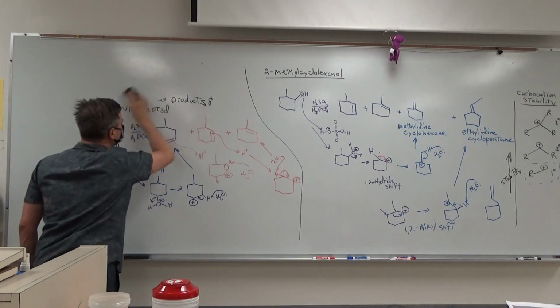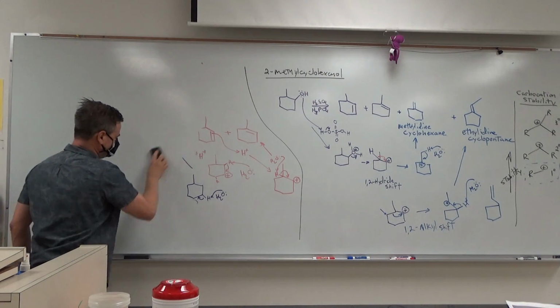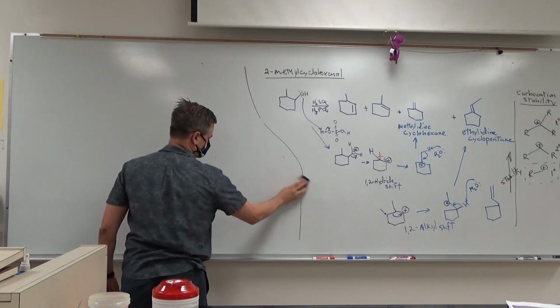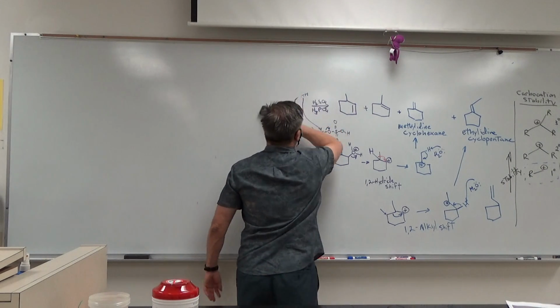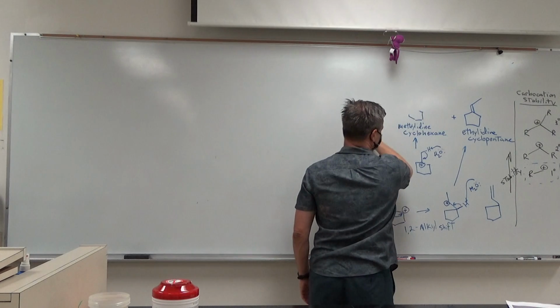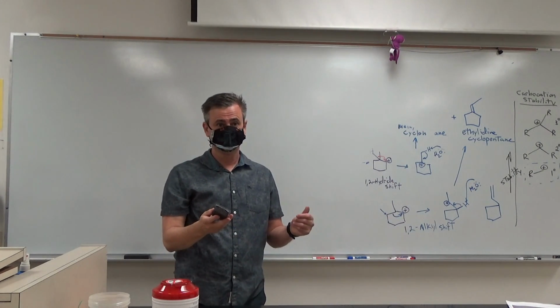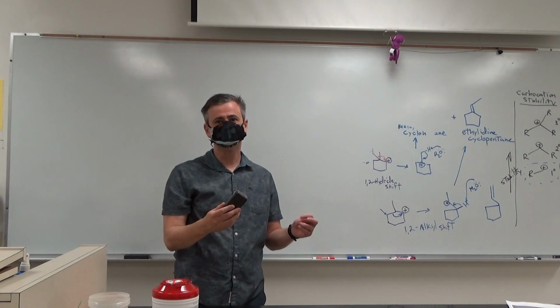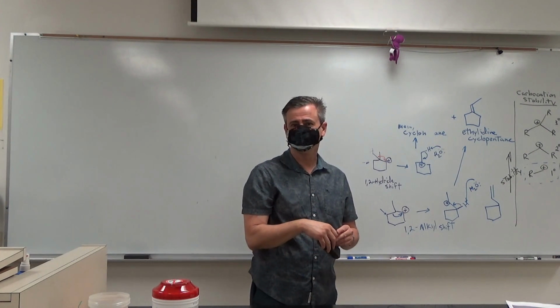All right, I want to talk a little bit about how we are going to identify what products you have and how we're going to know how much. Basically, what I want to describe is a very basic view, and Dr. Organ has talked about GC, right? GCMS and stuff? No, not yet. We haven't read about it or lectured on it yet.